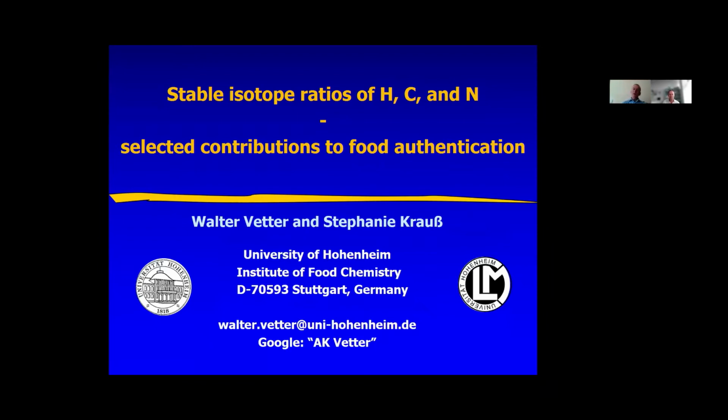And now I will present you something with only three ratios: hydrogen, carbon, and nitrogen. I will show you something we can do with it, but also where we must be careful. So I will start with some examples and first a little introduction.